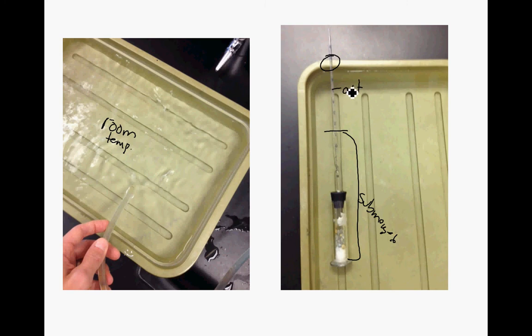If this is having a hard time, if it is floating up and not staying submerged, I'll show you. You can just put a test tube rack across that, and I'll show you that in the next image. But you want to submerge this. I believe the procedure says for around 10 minutes, or maybe it's less than that. I've got to check. But you want the temperature inside the respirometer to be the same as the temperature in the water outside, so you have to let that come to temperature.